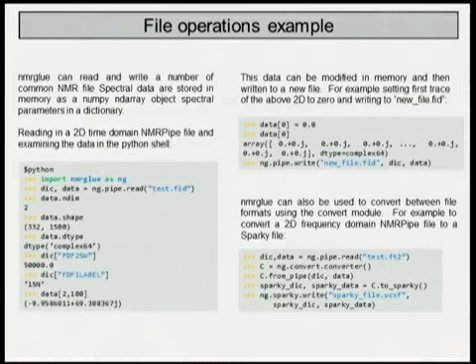We can also convert formats. The syntax for this: we read in the file, we initiate a conversion object, and then we load data into it with a from function. Then we can write out to it or create new data with a to. And then we can save that data. And that's a perfectly valid, in this case, Sparky file.